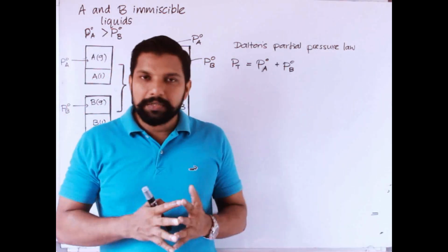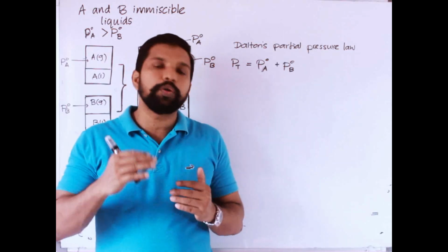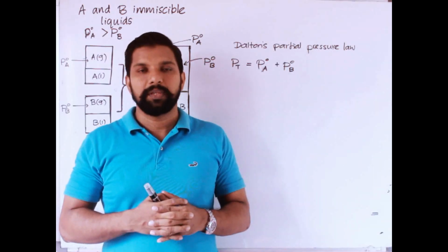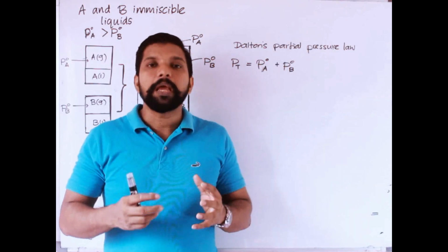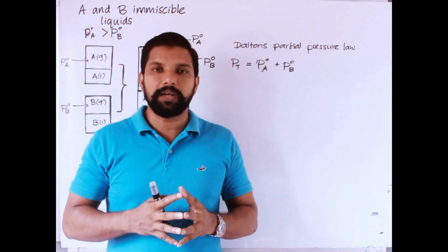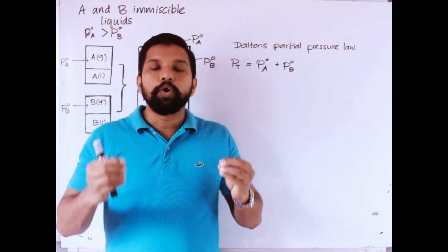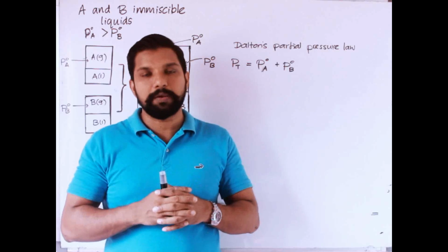When you mix two immiscible liquids, the liquid which has a low density will float on the other liquid. You might misunderstand that therefore the bottom layer will not be able to evaporate. We have to think a little more rationally. What will happen when we mix this mixture thoroughly, or stir this mixture thoroughly? The liquids will break into small droplets, and both the liquid droplets are able to evaporate because they are coming to the surface at that moment.